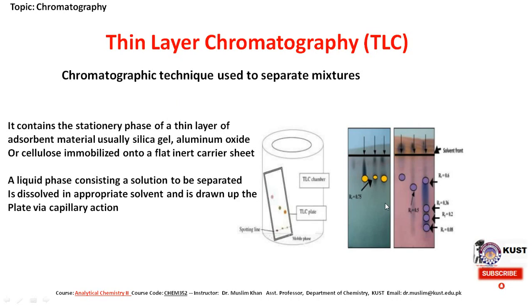So these TLC plates are preferably ready-made with a stationary phase, like they are available in the market. These are stable and chemically inert plates where a thin layer of stationary phase is applied onto the whole surface. The stationary phase on the plate has a uniform thickness and a fine particle size.